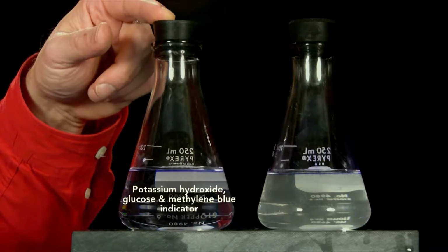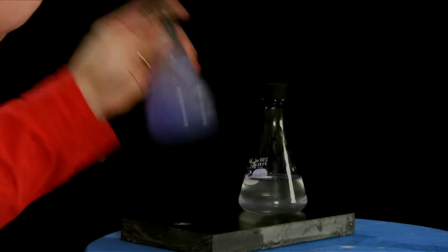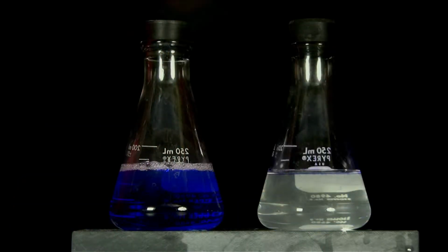I have here a flask half filled with a solution of potassium hydroxide, glucose, and methylene blue indicator, and filled the rest of the way with oxygen gas. I shake the flask and the oxygen mixes with the solution. What happens, say you? They together produce no such combustion as was seen in the case of the candle, but see how the presence of oxygen is told by its association with these other substances. What a beautiful colored solution I have obtained in this way, showing me the presence of the oxygen.